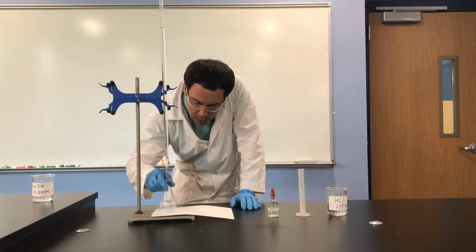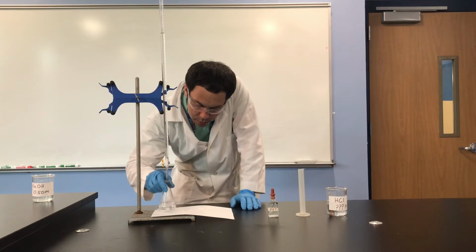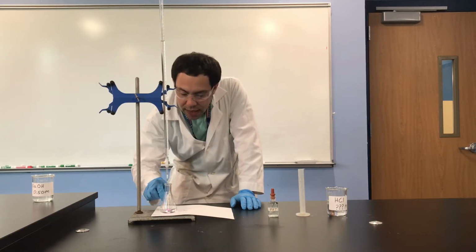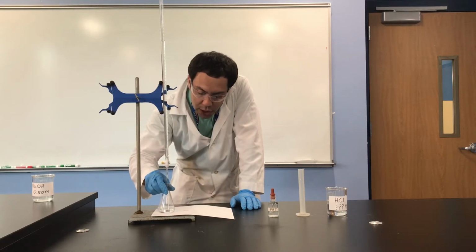Swirl as the base is being dropped into the acid. And I'm looking for any faint pink color. Make sure you're swirling it the whole time. All right, so I see a little bit of pink in there. I don't know if you could see it on the camera. So I swirl it, but when I swirl it, it goes away.